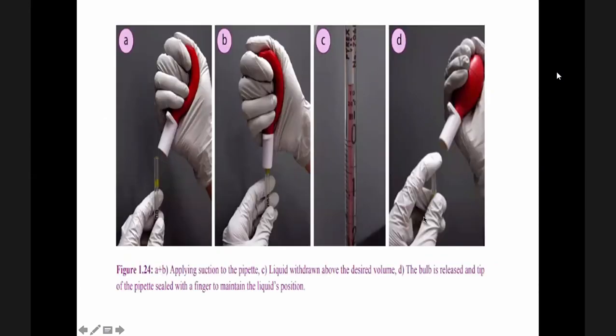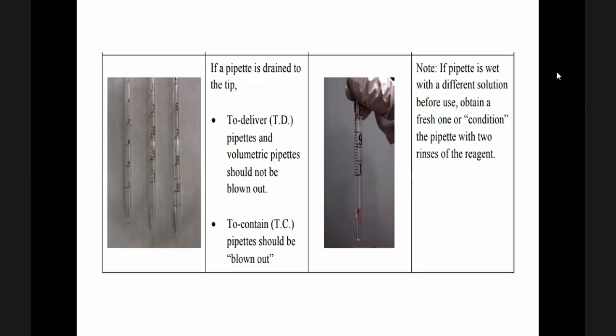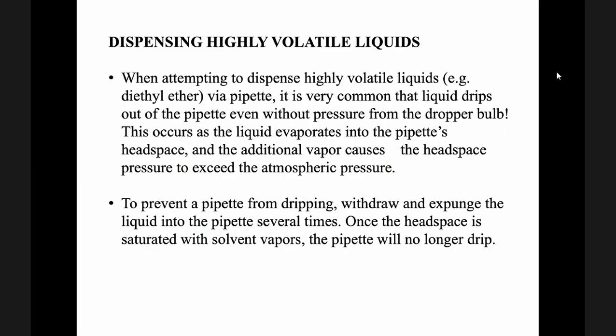Okay. So you already know this one, no? How to use the pipette bulb. Then a summary of what we have discussed.